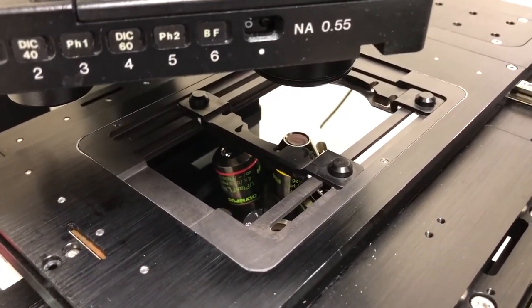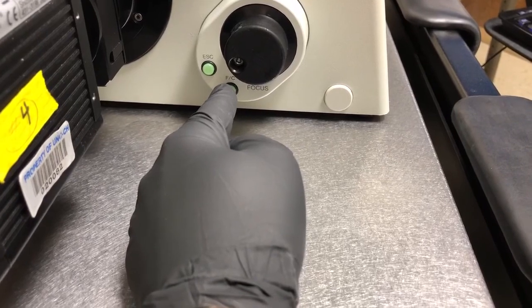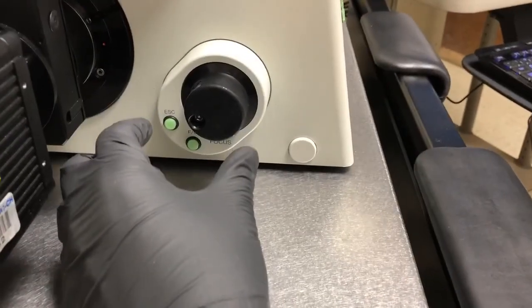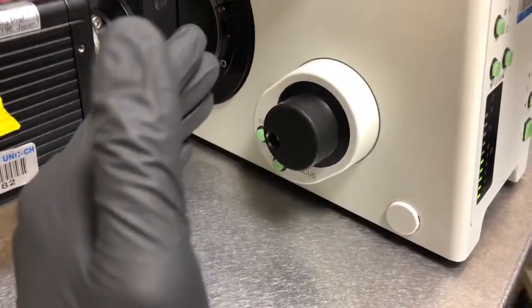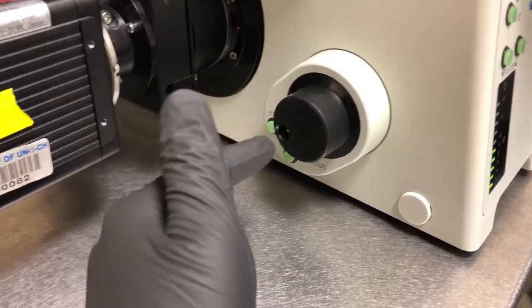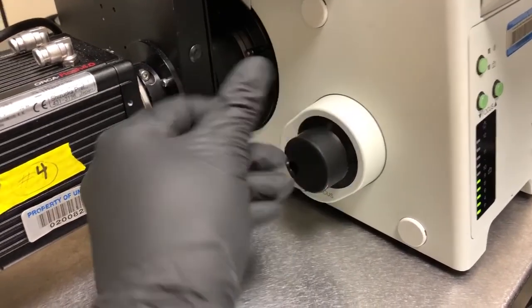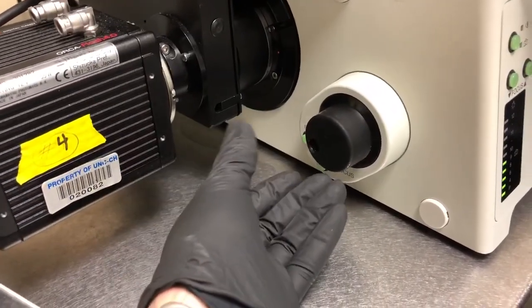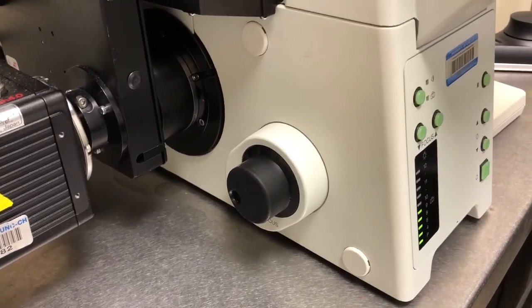If we press escape again, it'll go back up to wherever it was, so we always want it at the bottom when putting on samples. The FC button toggles between fine and coarse focus — there aren't two separate knobs like on some other microscopes. For bright field, there's nothing on the microscope that shows you whether you're on fine or coarse, but it starts in fine. Also, on Olympus microscopes, turning the focus knob away from you lowers the objective; turning it towards you raises it — exactly opposite from Zeiss microscopes.